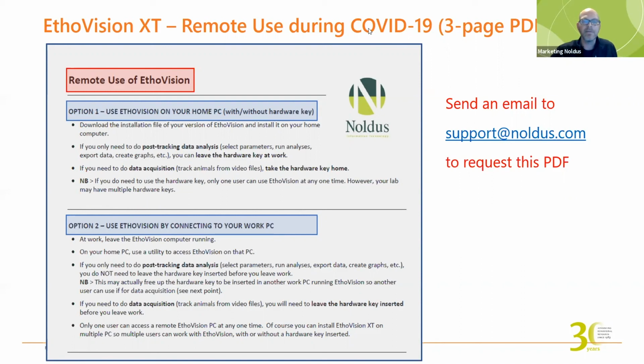Yeah, and obviously for the movement parameter, you would have to set those different velocities yourself. By default, I think it's set to moving when over 2 centimeters per second, and not moving when I think it's 1.75. You could use your minimum and maximum and look at your integrated visualization and make your determination from there. Then it becomes an on-off state: you're either moving or you're not moving. And not moving is not exactly 0. There's a lower threshold above 0 for not moving. That's how it works.